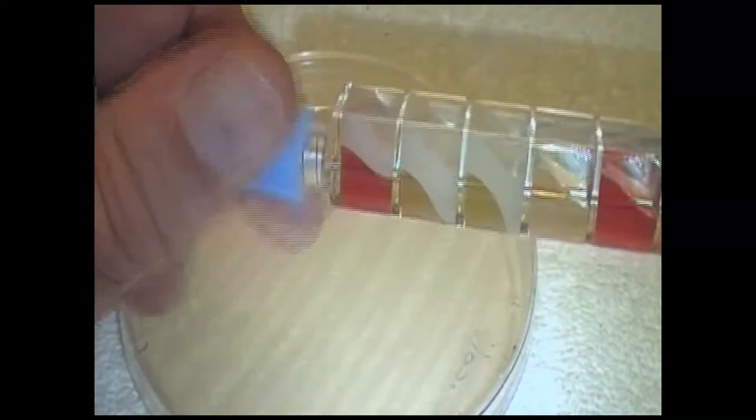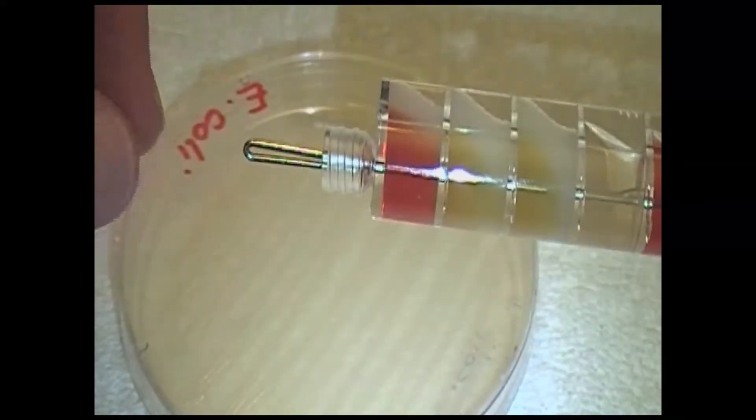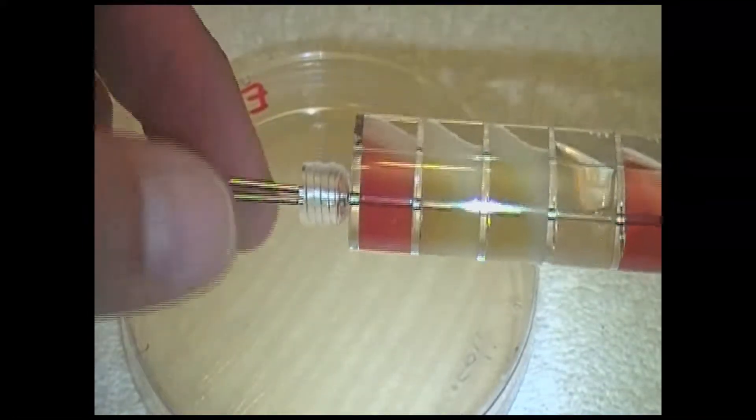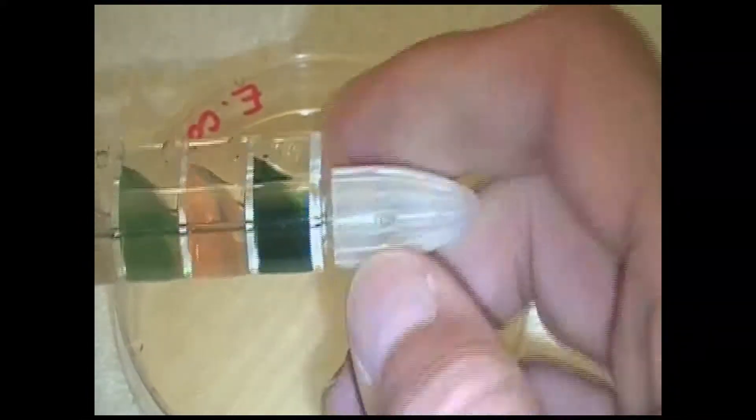We are going to start by taking this end off. This end, the little wire is bent. This wire is sterile. Then we're going to come down to the other end, and we are going to take the little cap off.